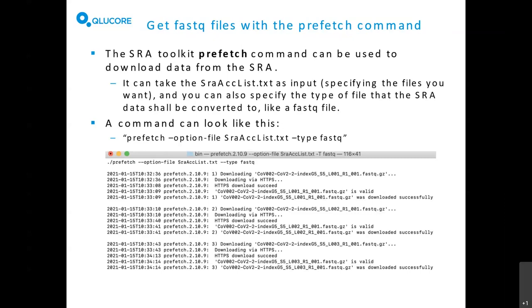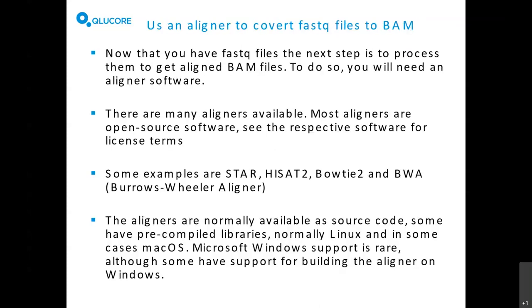This is how the log may look — you can see the prefetch command has started and it begins downloading the different FASTQ files. This may take several minutes depending on the size and speed of your internet connection. You can also select different regions of the world to download from the same repository. Be careful — there may be some hiccups and you'll need to run the command again; it will only pick up what hasn't been completely downloaded. After a while you will get all the data downloaded, but these are large files so you need a lot of disk space.